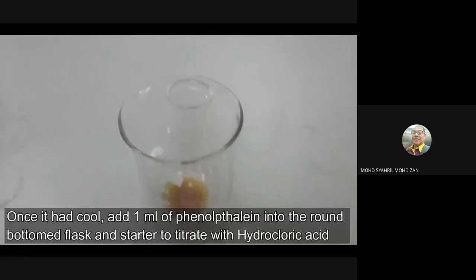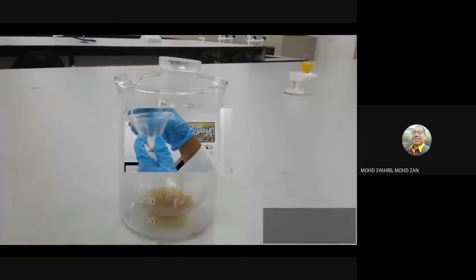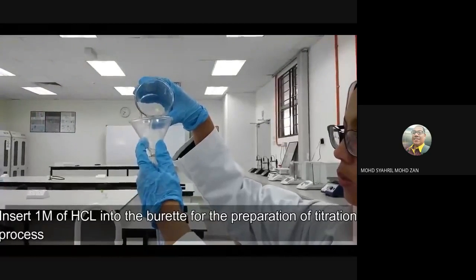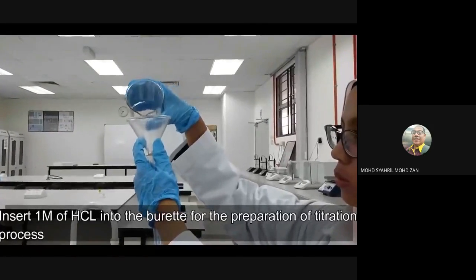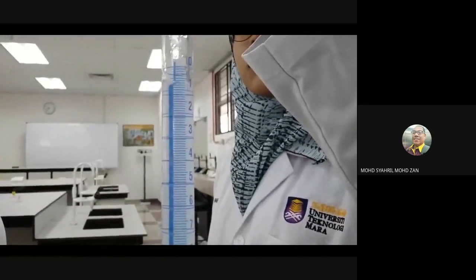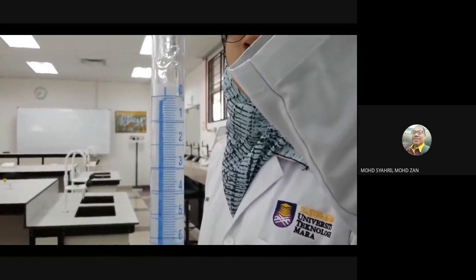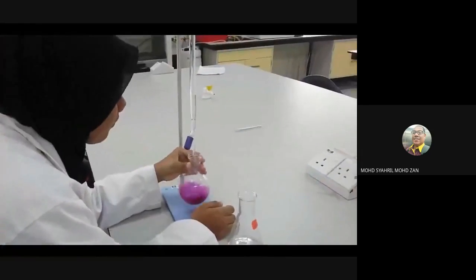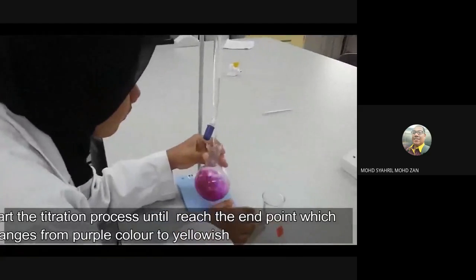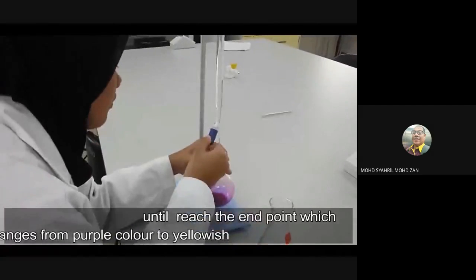Once it has cooled, add 1 ml of phenolphthalein into the round bottom flask and start to titrate with hydrochloric acid. Insert 1 molarity of hydrochloric acid into the burette for the preparation of the titration process. Stop the titration when you reach the end point, where it turns from purple color to yellowish.